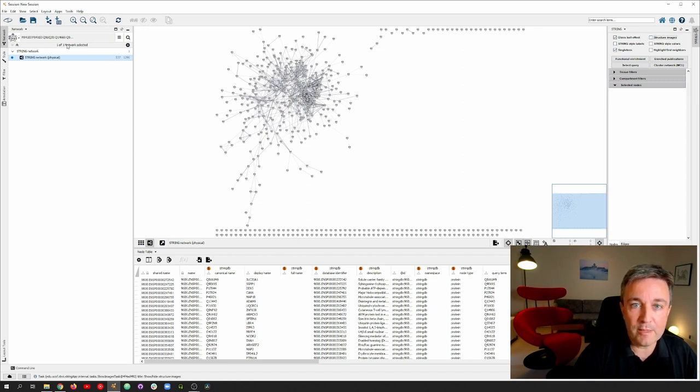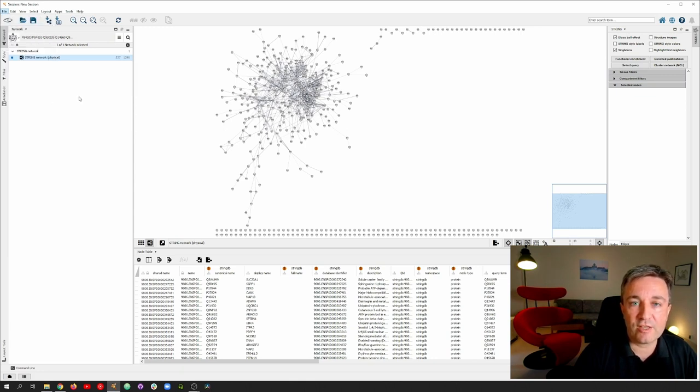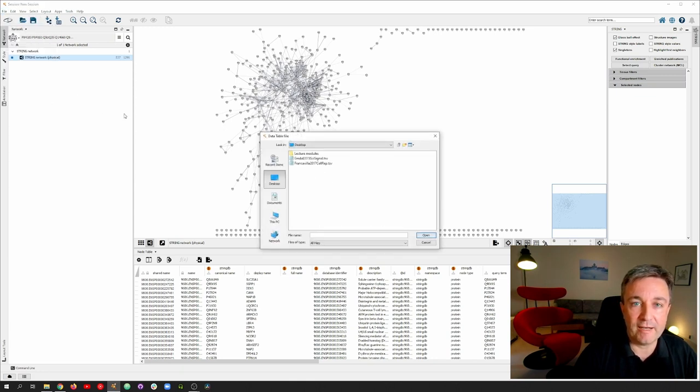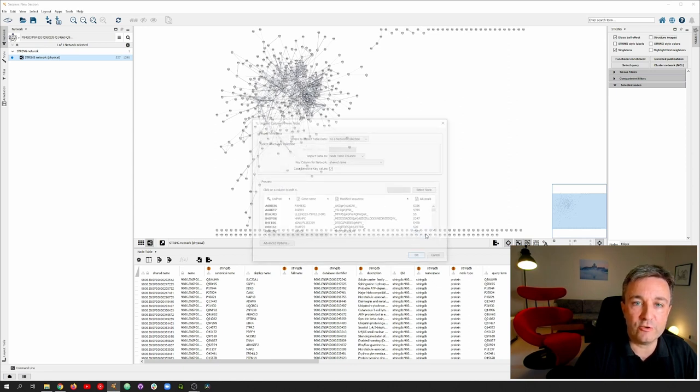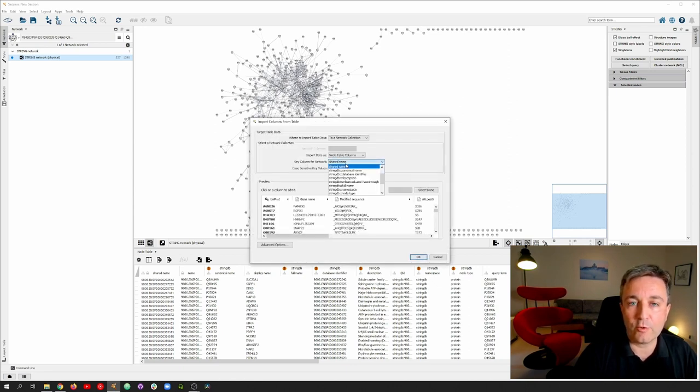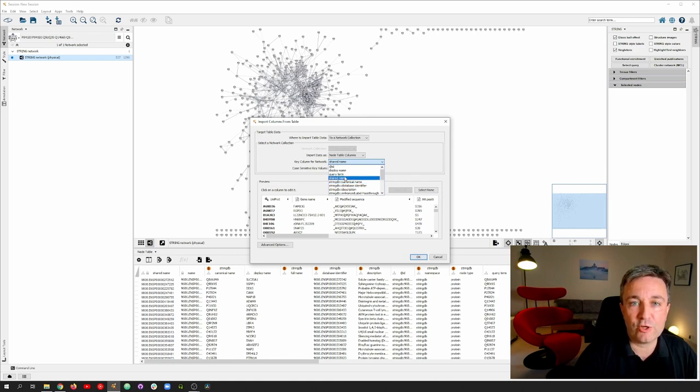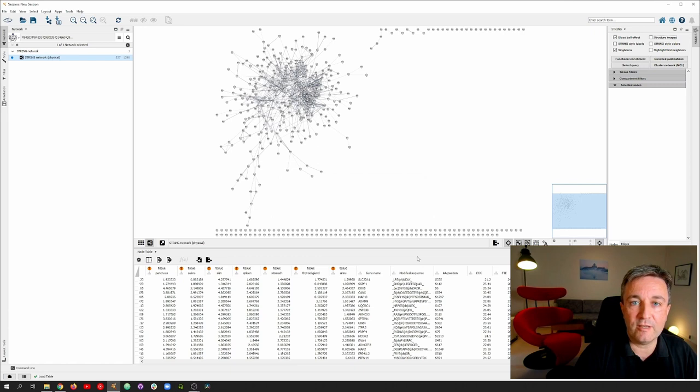We go to the file menu and choose to import a table from file, thereby importing the spreadsheet with all its data into the note table. In the import dialog, we again remember to adjust that we want to use the query term column for matching the names from the spreadsheet.